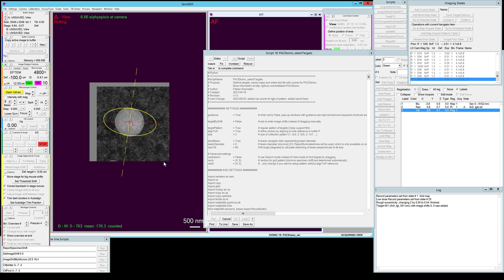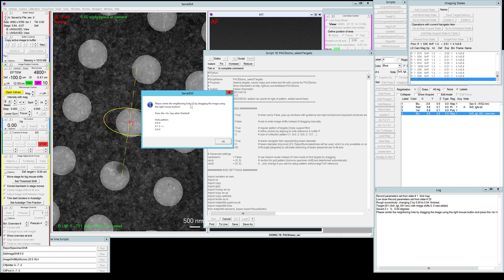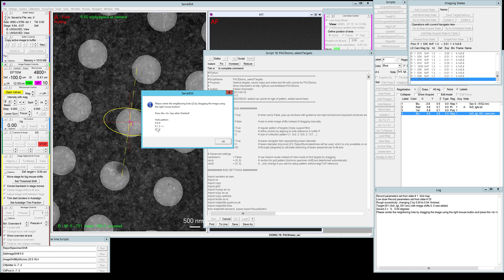The next step will be to define the rough grid vector. For that it will take a full scale view image and it will ask you to center the neighboring hole by dragging the image using the right mouse button and then hit B when finished. To make sure that you drag it to the right hole I made a little graphic here.